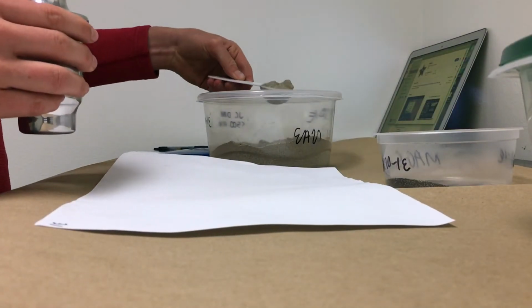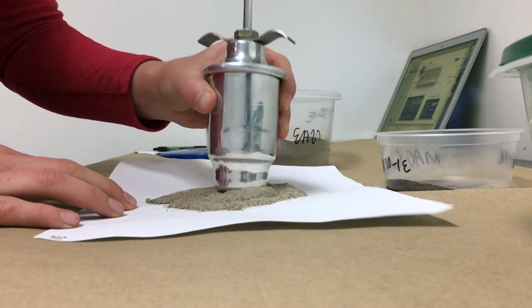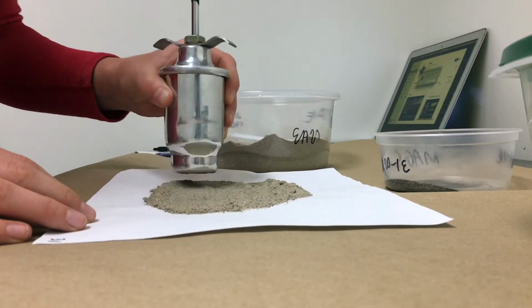The next step is defiling with a hand magnet. First, we pour some sample onto a white piece of paper, spread the sample around, and collect the magnetic filings, and we drop them off in the mags container.